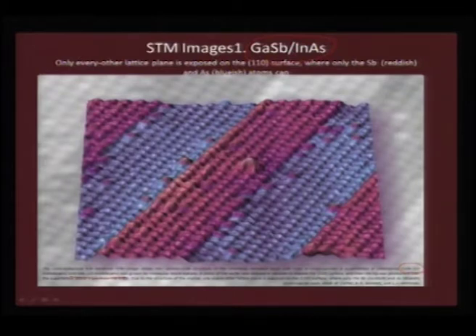As you can see here, the repeat is 1, 2, 3, 4, 5, 6, 7, which corresponds to 14 monolayers of indium arsenide, and 6 such maxima are there corresponding to 12 gallium antimonide layers. So, you can essentially map how these interfaces are growing, and you can see each one is a repeat.